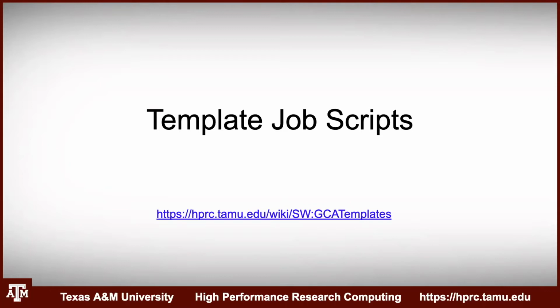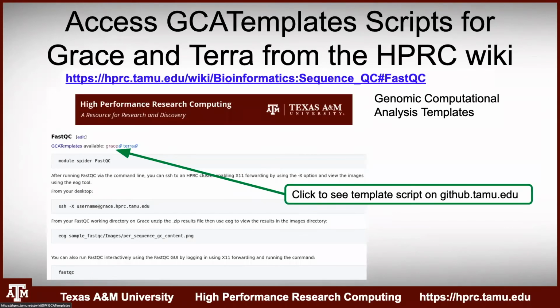I can go and look for one of Dr. Dickens' templates, and it shows you exactly what you need to do to run it on one of our clusters. So let's go ahead and go look.